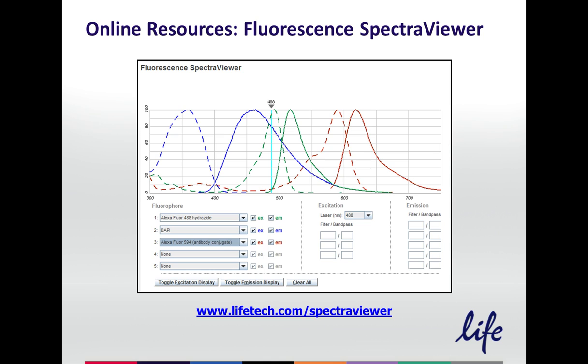You can also look for the overlap in these dyes to determine how good they'll be for FRET, for instance, or whether or not there'll be bleed-through between filters with these dyes.